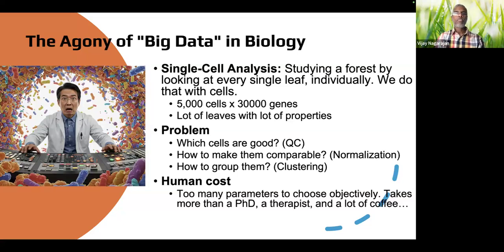And then on top of that, you take these clusters and do really cool stuff, like interactions: how the cell clusters interact, how they transition between states, and the relevance of these clusters in terms of their interactions. Is it possible that one population is influencing the other population, stuff like that.